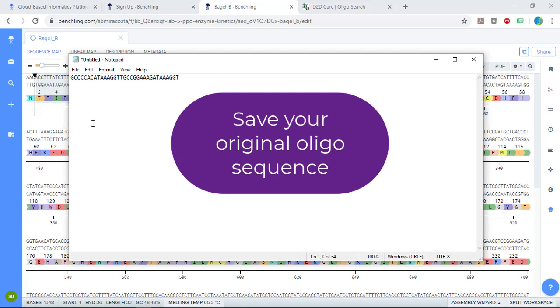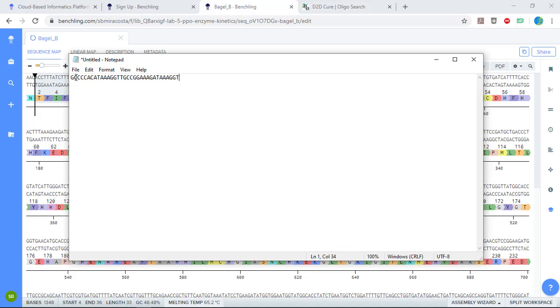Review the genetic code table and choose the appropriate codon representing the mutant amino acid you want to substitute in the sequence. Change the reverse complement oligo sequence you saved to code for the complement of that codon in your oligo.